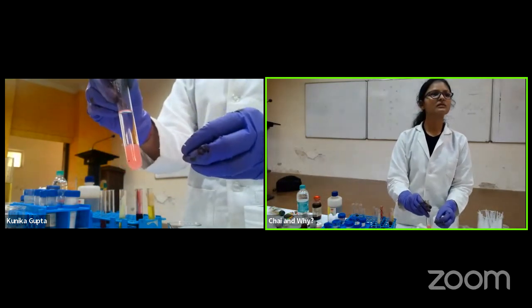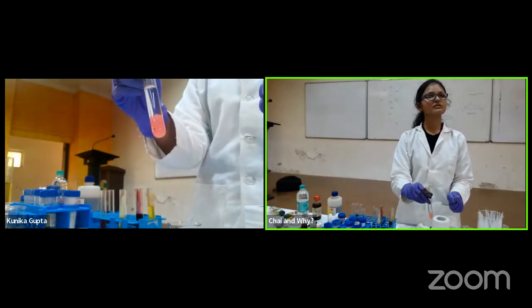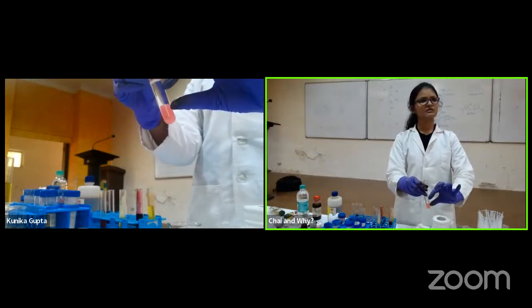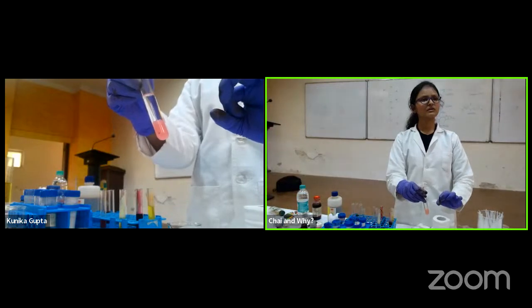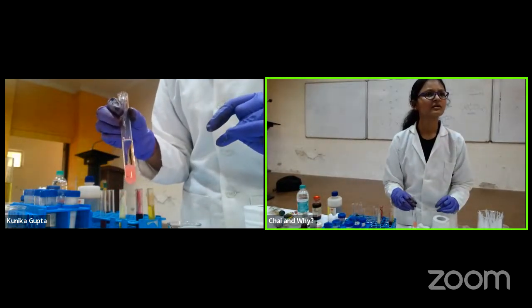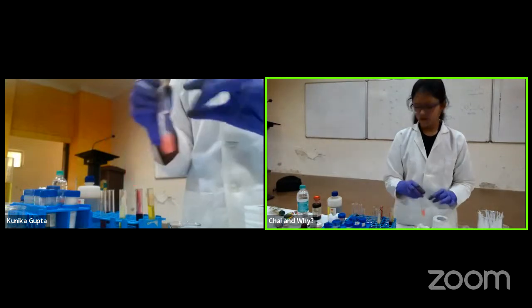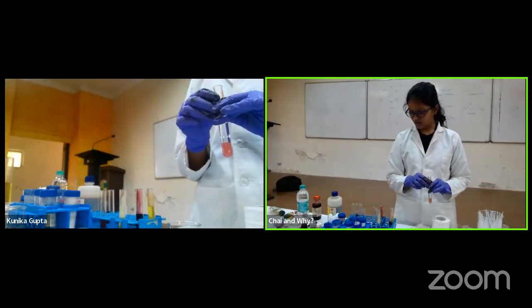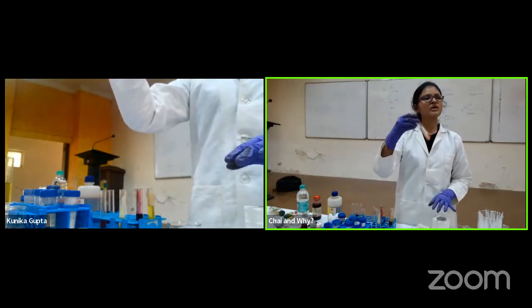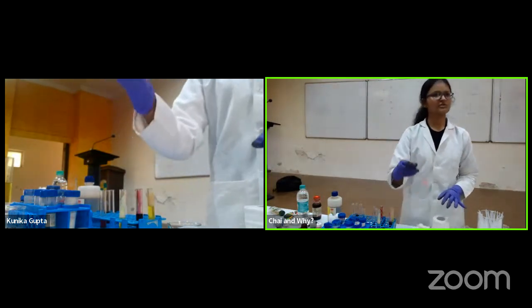Yeah. Repeat what again? What is the exact step for it? I just added water to this. Yeah, can you call it something? Sorry, I didn't get your question. You used it in the last 1 minute or so. No. You call this procedure something. Like what is this called? This thing. Oh, this is called extraction. Okay, sorry. Yeah, so this is just extraction.